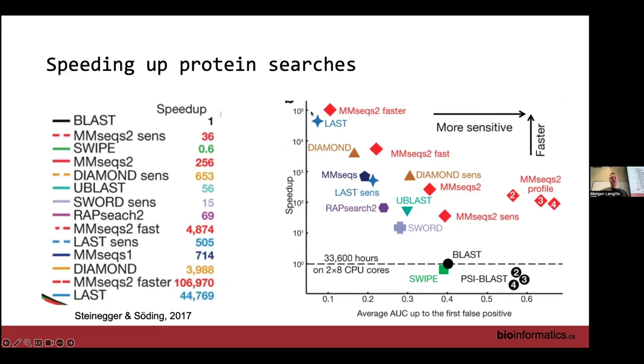Lastly, sorry, I did forget about these two, but it's been addressed a little bit by Robin yesterday, and we talked about it briefly, is there are more specialized gene annotation systems. So HUMAnN and Microbiome Helper try to just characterize everything at a level for metagenomics. And obviously, depending on what you're interested in, there's a lot more targeted things you can do. And usually these are pretty easy. And the reason why I showed you like brew your own, you can do this fairly straightforward.